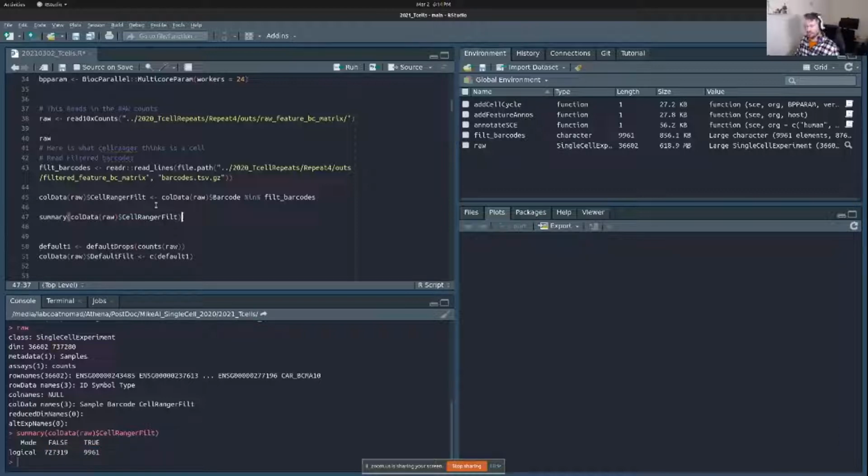That's great. Cell Ranger 5, which is the version I ran this data on, uses a set of genes, kind of like a mini database, and it basically correlates that to if all these cells match these profiles, then they're probably cells. But the old way Cell Ranger used to do it is it used to basically take a cutoff. Henry showed us those rank bar plots from before. He showed us that bad one, and he showed us that really sexy one. And generally speaking, your real data is going to look like something in between.